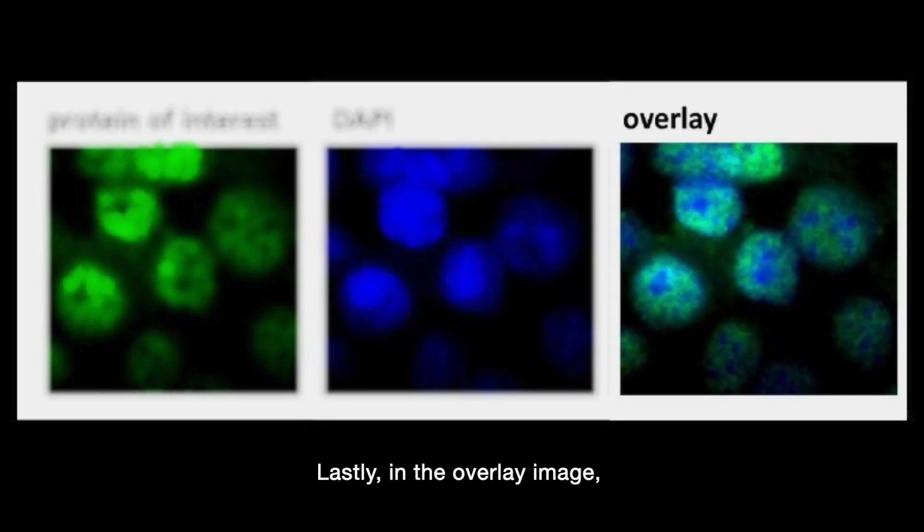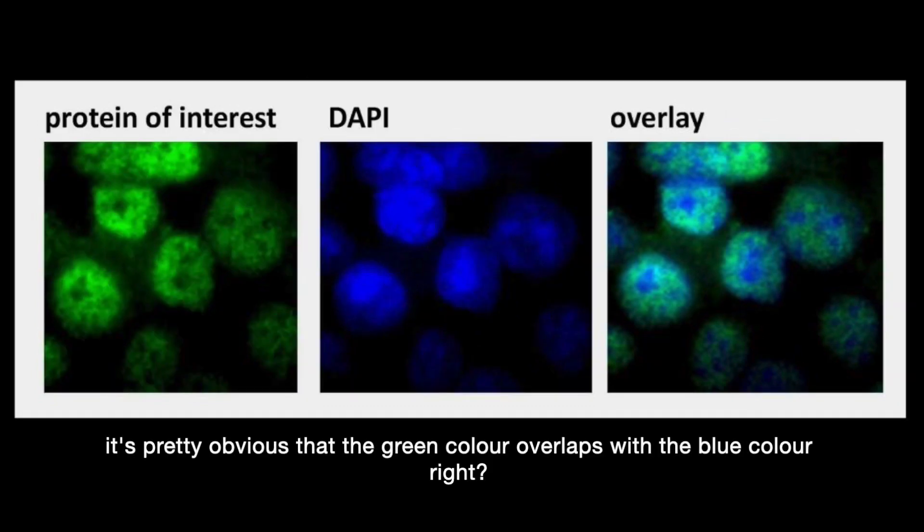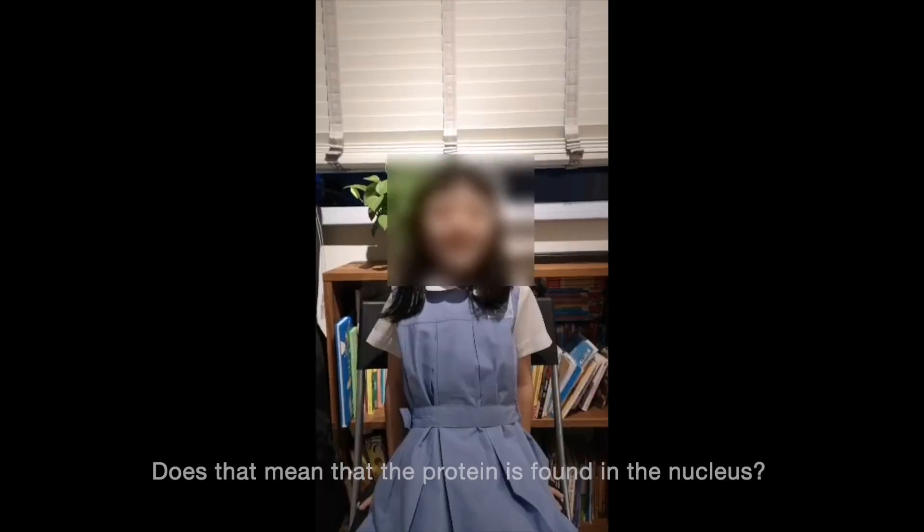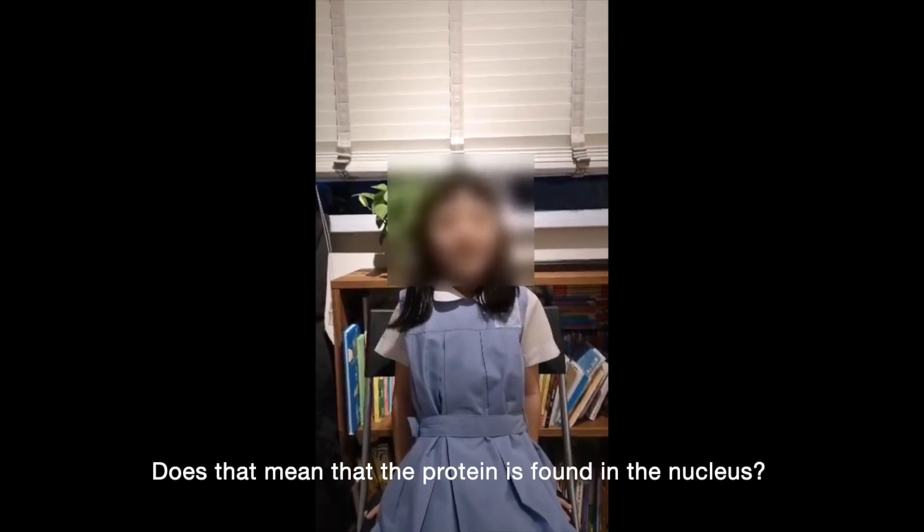Lastly, in the overlay image. It's pretty obvious that the green color overlaps with the blue color, right? Do you know what that means? Does that mean that the protein is found in the nucleus? That's right! With this concept of colocalization, you can find out if your protein of interest is in the nucleus or any specific organelle.